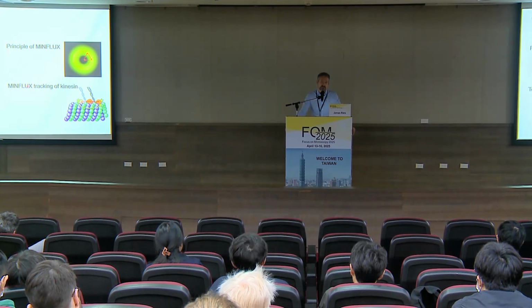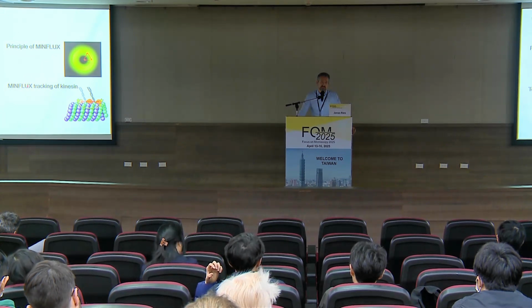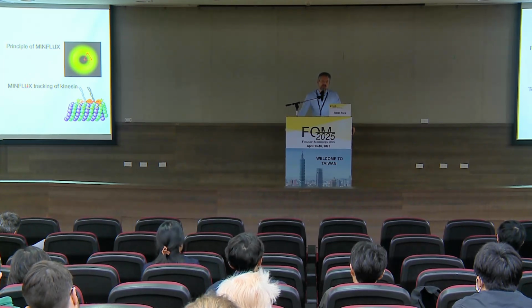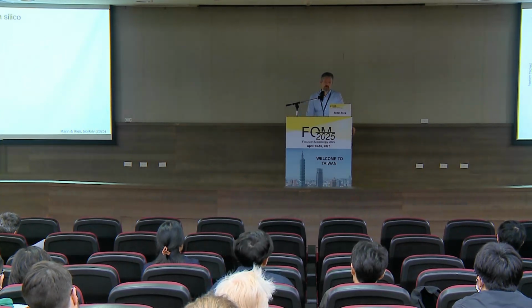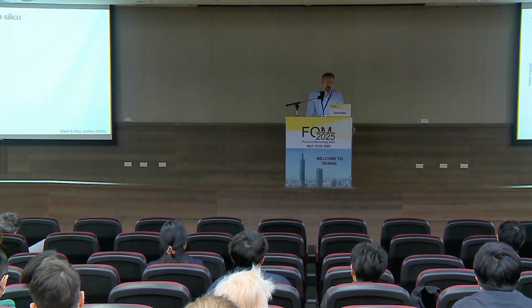But the timing, or the exposure time, or some scanning time, was already optimized for some conditions, or how did you determine that? Is it the fastest one? So in our simulations, actually I can even show this. In our simulations, we use the standard sequences that are provided by the company, and they're already quite optimized.